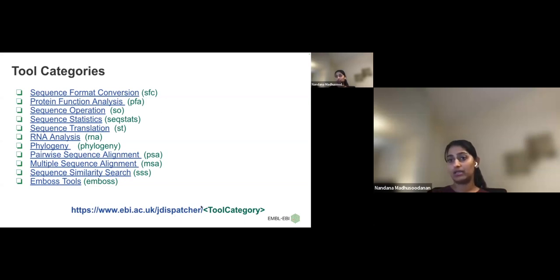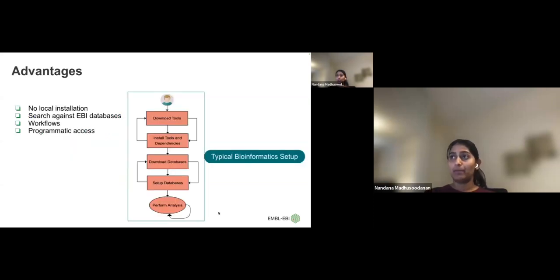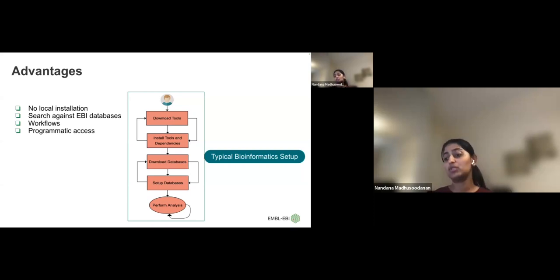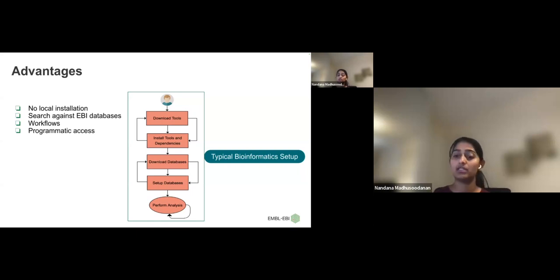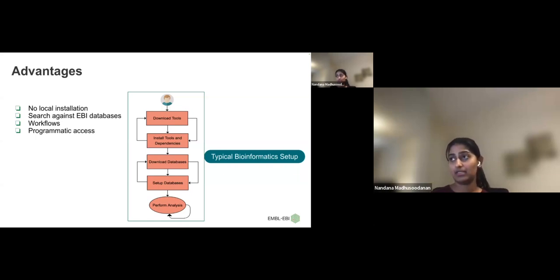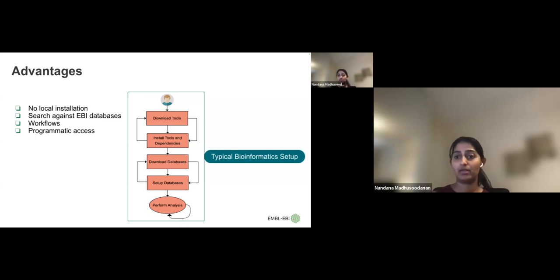The main benefits of using Job Dispatcher are that some tools don't have any official web interface — for example, Clustal Omega and MUSCLE for multiple sequence alignment have no interface to run them directly; you would need to download the tool and install dependencies. With Job Dispatcher, everything is installed in our environment, so you don't need to write any Unix commands. You can come directly to our website, provide the input, change parameters, and run the tool smoothly.